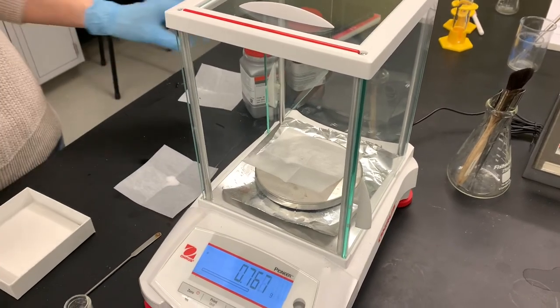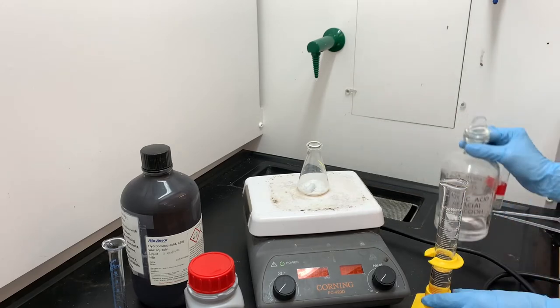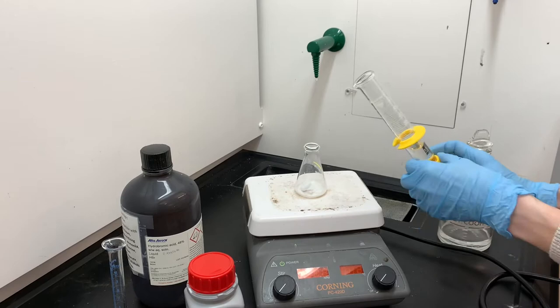This will be added later. Now I'm going to be adding the glacial acetic acid. I've got 20 milliliters already measured out. That's going to go straight into this Erlenmeyer flask with the vanillin.